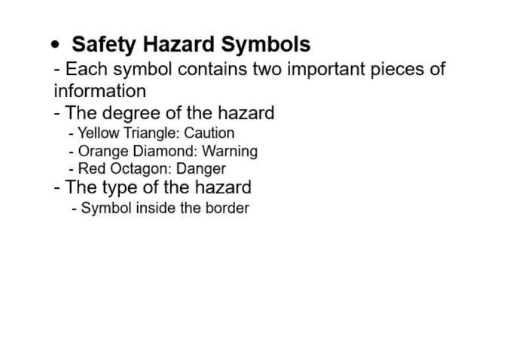I actually have it written on the next slide. So if you do have the notes printed off, it's on the next slide. If not, here it is. In terms of danger, and you need to memorize this, just write this down. And before the test, just look it over and memorize it. Yellow triangle, caution. More dangerous than that, an orange diamond, a warning, and a red octagon, dangerous.